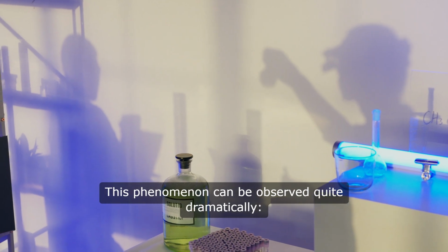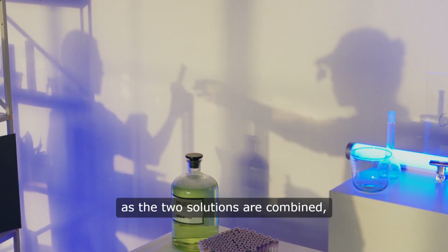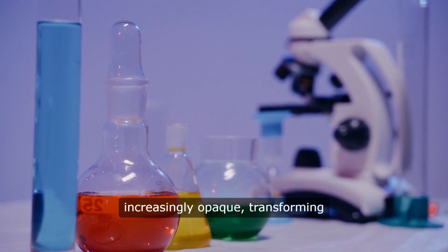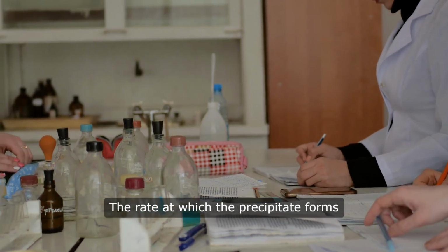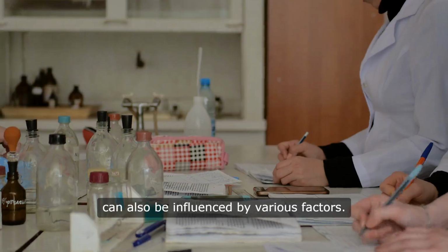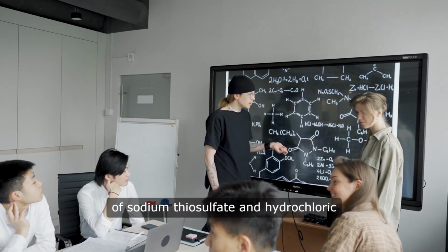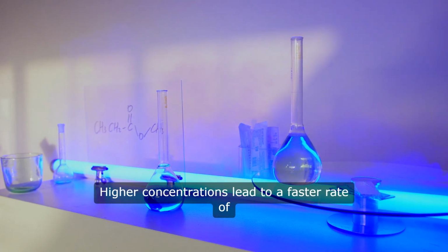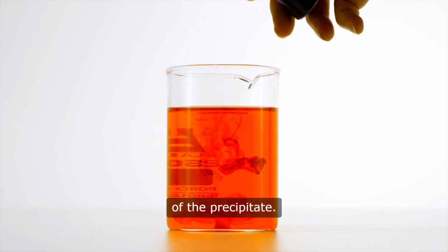This phenomenon can be observed quite dramatically. As the two solutions are combined, the initially clear liquid becomes increasingly opaque, transforming into a milky suspension. The rate at which the precipitate forms can also be influenced by various factors. For instance, the concentration of sodium thiosulfate and hydrochloric acid plays a significant role. Higher concentrations lead to a faster rate of reaction and a quicker formation of the precipitate.